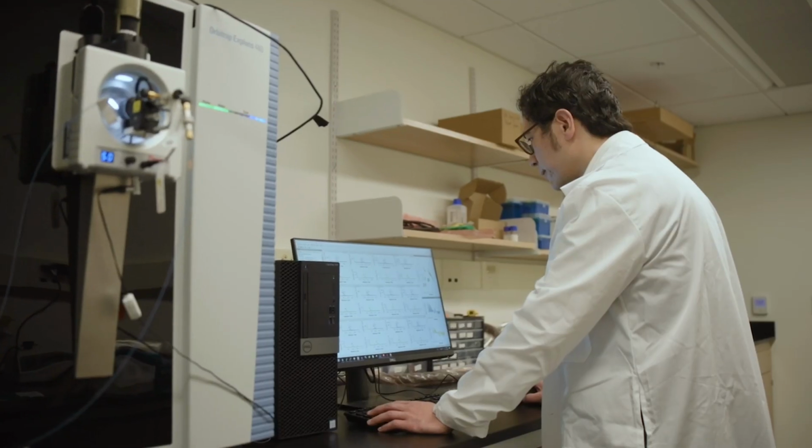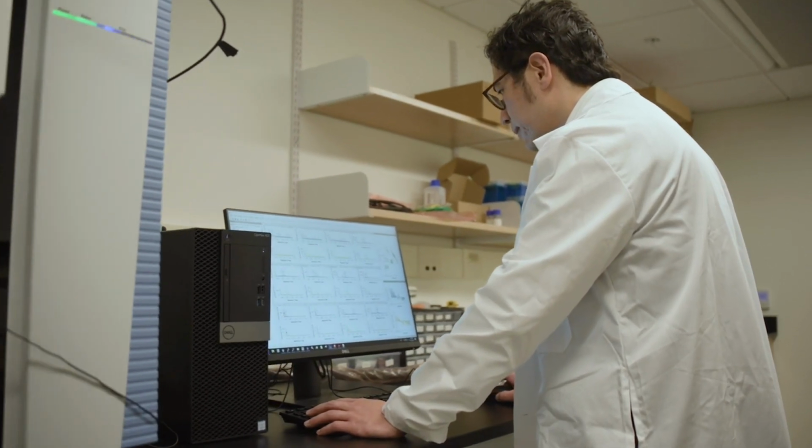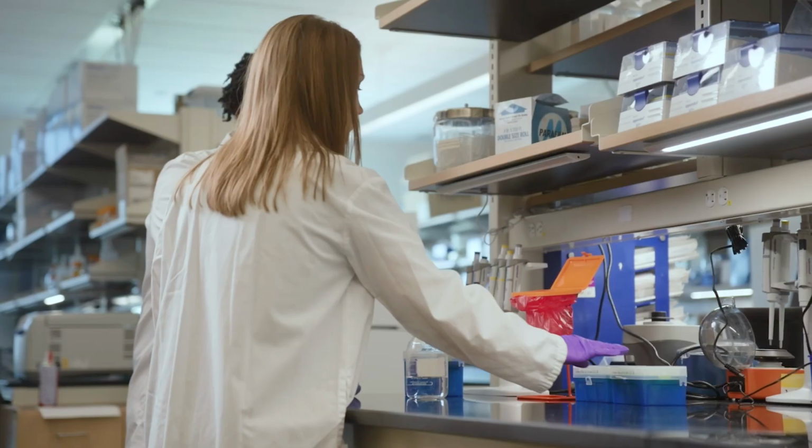And this cuts out so many steps in our workflow for trying to make the best measurements possible. Because our lab is focused around making measurements on Thermo Scientific mass spectrometers, we have designed our software to actually output an inclusion list directly for use on the Stellar mass spectrometer. And so the software automatically generates all the way through from target refinement and selection out to an inclusion list that we can plug right into the method editor so that we can make our measurements directly with ease.